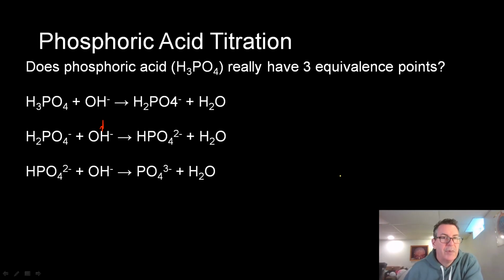Hi there. In this video, I'm going to talk about phosphoric acid. Something that's always kind of interested me was that when you did a titration of phosphoric acid, something I do in a lot of my teaching labs, we only ever see 2 of the 3 equivalence points. Technically, there are supposed to be 3 equivalence points, right?